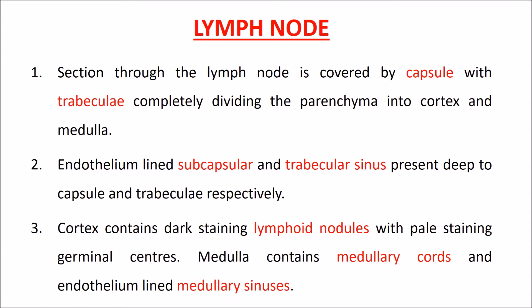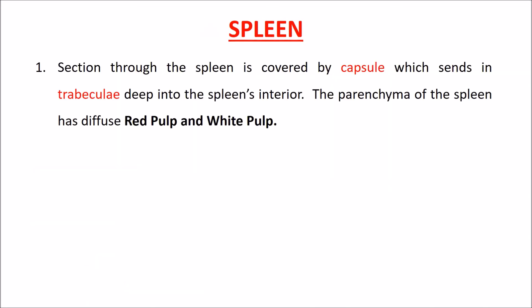The medulla contains medullary cords and endothelium-lined medullary sinuses. Spleen: a section of the spleen is covered by a capsule which sends trabeculae deep into the spleen's interior.